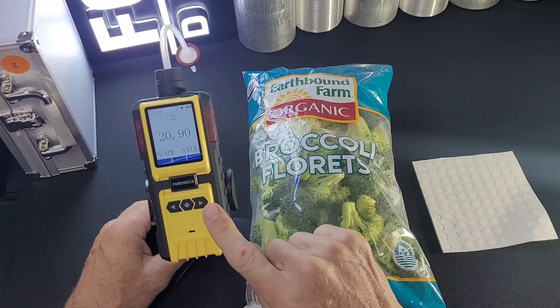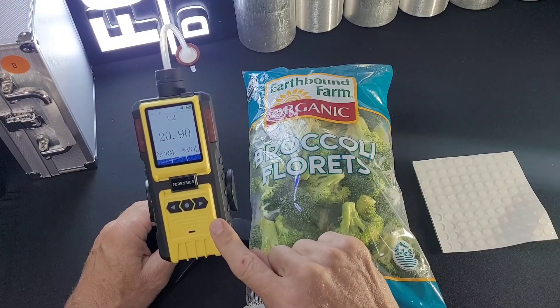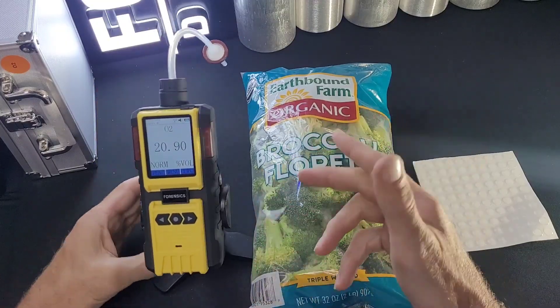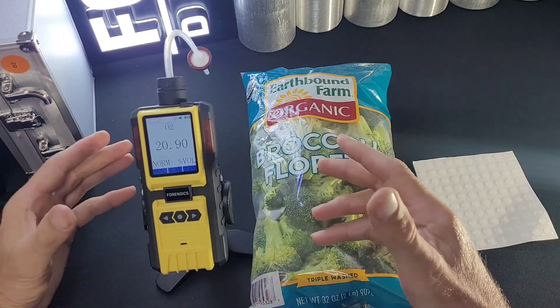This is our FD-600-02 Headspace Analyzer. It is sitting on our gas detector stand. It's quite nice, especially for the food industry where it can be hands-free. It's very strong, heavy, and stable.